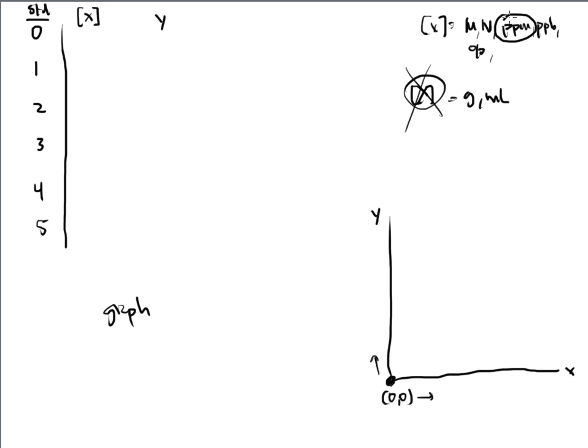And our equipment can't handle samples that strong. Our equipment is made to handle very weak samples because we're looking for very small amounts most of the time. So the x unit, the x-axis, has to be concentration. And that's one of the reasons that we write concentration that way, with an x, a bracket around the x.